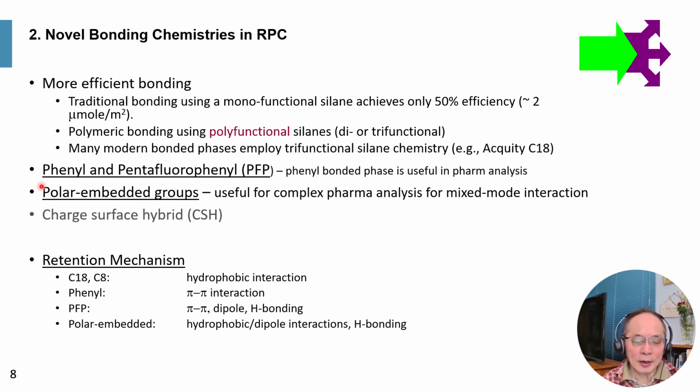There are other bonded phases, such as phenyl, and this one is a pentafluorophenyl, which is very effective for analyzing more polar drugs. There's also a class called the polar embedded group, in which one actually bonds a polar group within the hydrophobic chain.